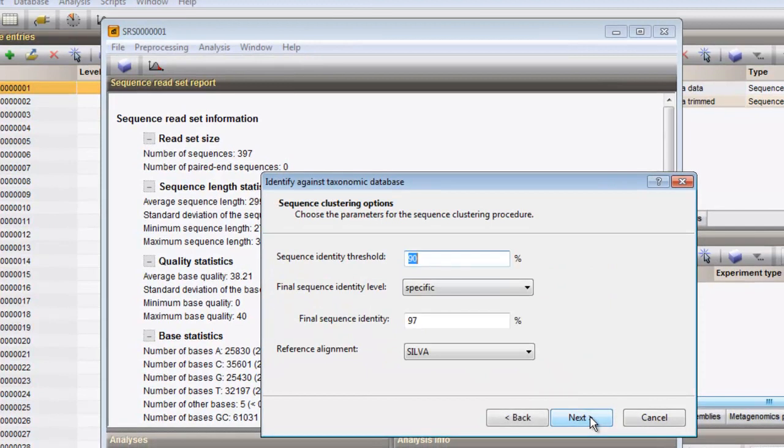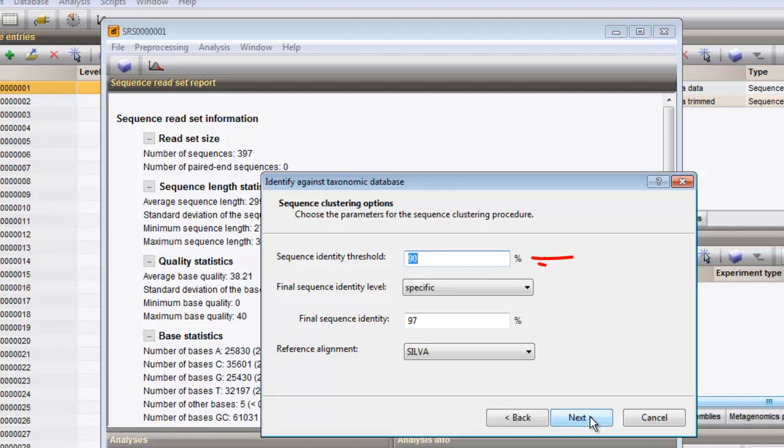Next, the sequence clustering parameters should be defined. I leave the sequence identity threshold at 90%, and I specify a final sequence identity of 95% for the sequences in the obtained clusters.